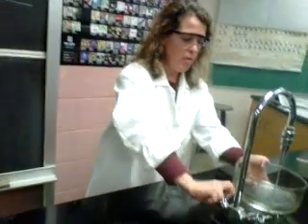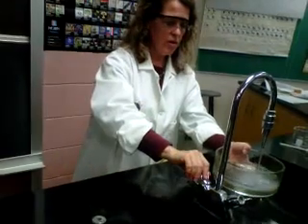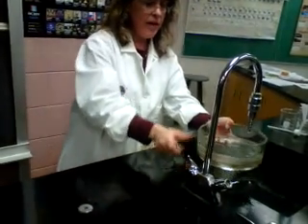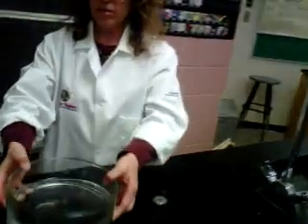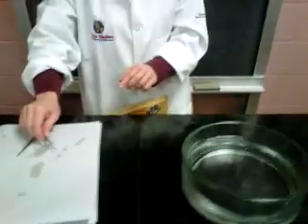What do you think will happen when we put the sodium in? Remember, it's further down the periodic table, down the group. Probably just a lot faster. Could be a little more reactive or a little less reactive? More, could be. All right, we ready? You might want to give this one a little bit of space.